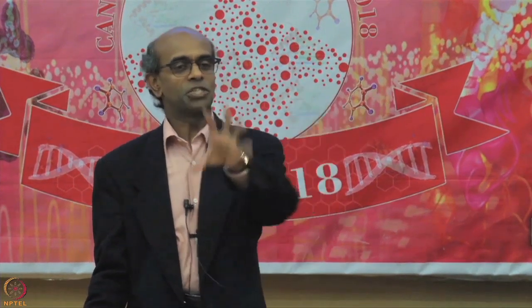Say you have 15 TMT experiments you need to do. You did 5 in January, 5 in May, and the remaining 5 in winter. This is all one project, and you had a lot of vacation left over, so you weren't there to finish all of them. Now you want to put all of them together and do an analysis. It's likely that the data you get from each set of 5 are going to be significantly different, and that is because of technical variation, not because of biological differences in the samples you used. Correcting for that is called batch correction.